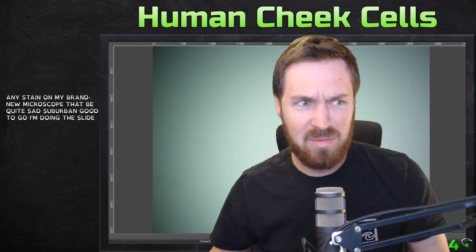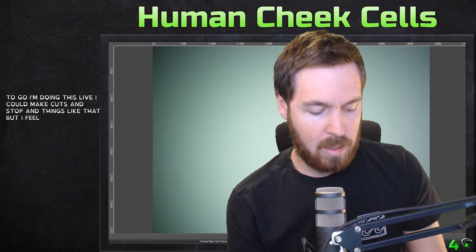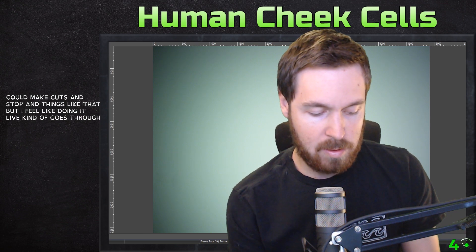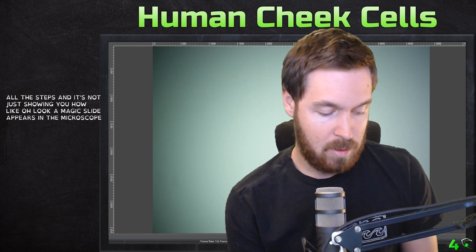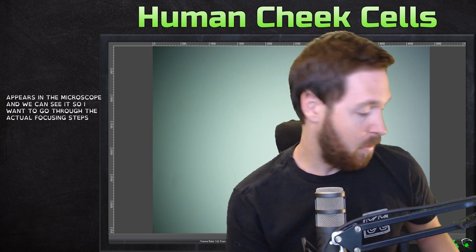I'm doing this live — I could make cuts and stop, but I feel like doing it live goes through all the steps properly. It's not just showing you, 'oh look, a magic slide appears in the microscope and we can see it.' I want to go through the actual focusing steps and things like that.